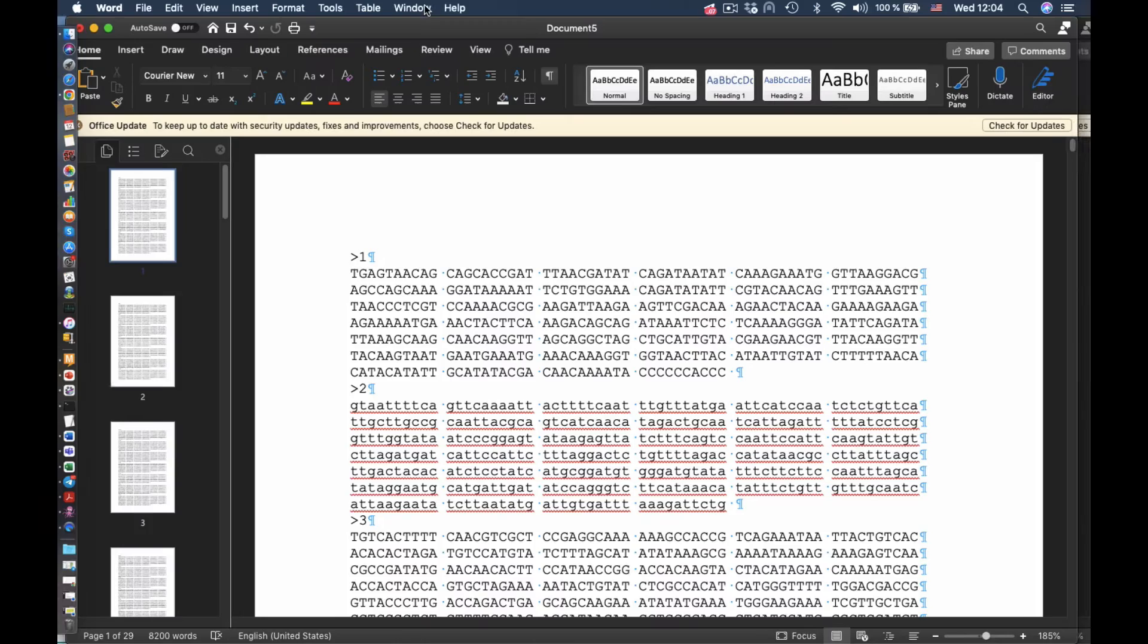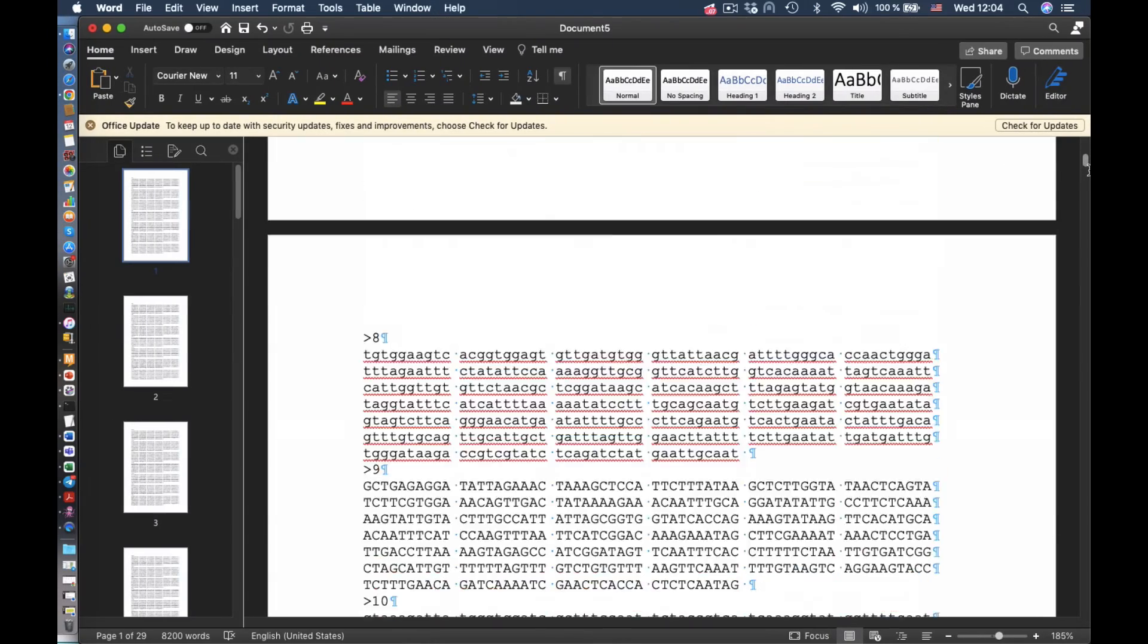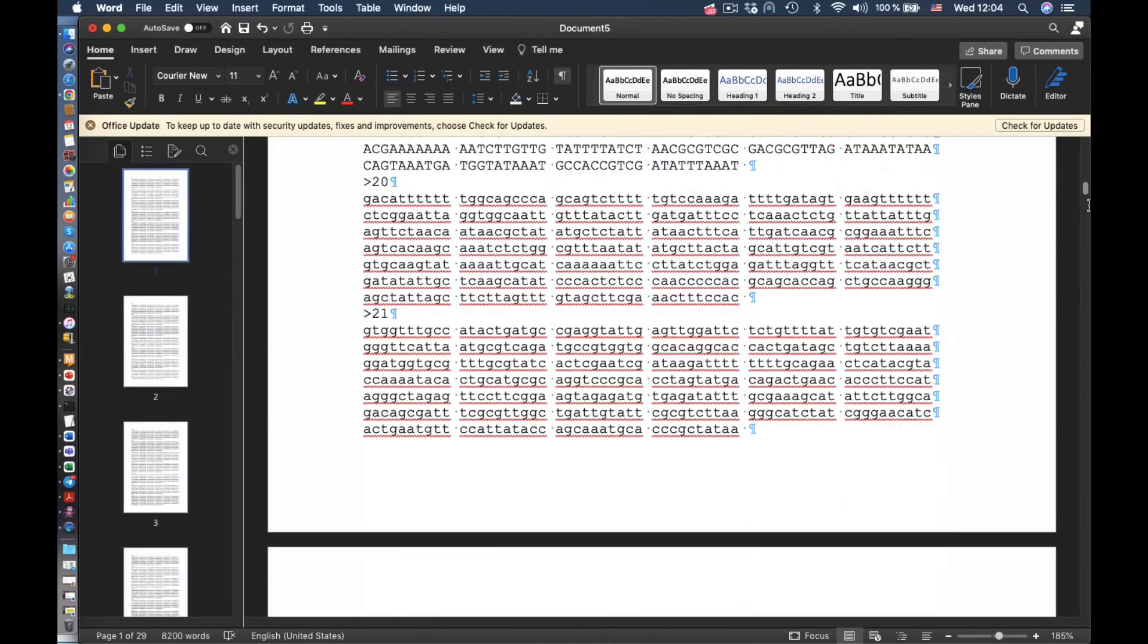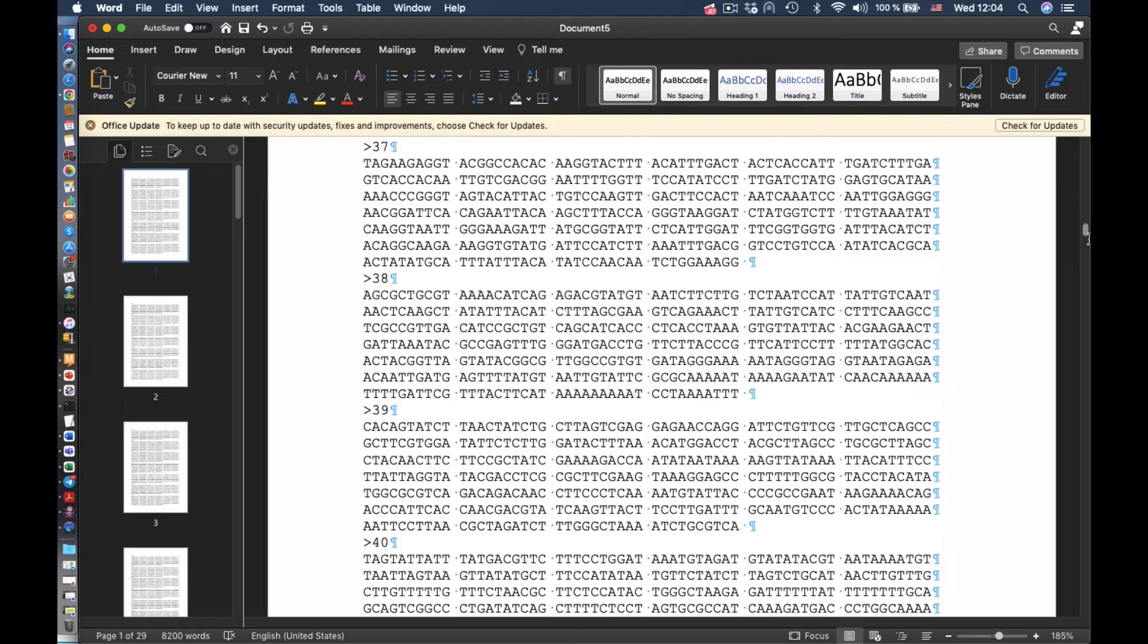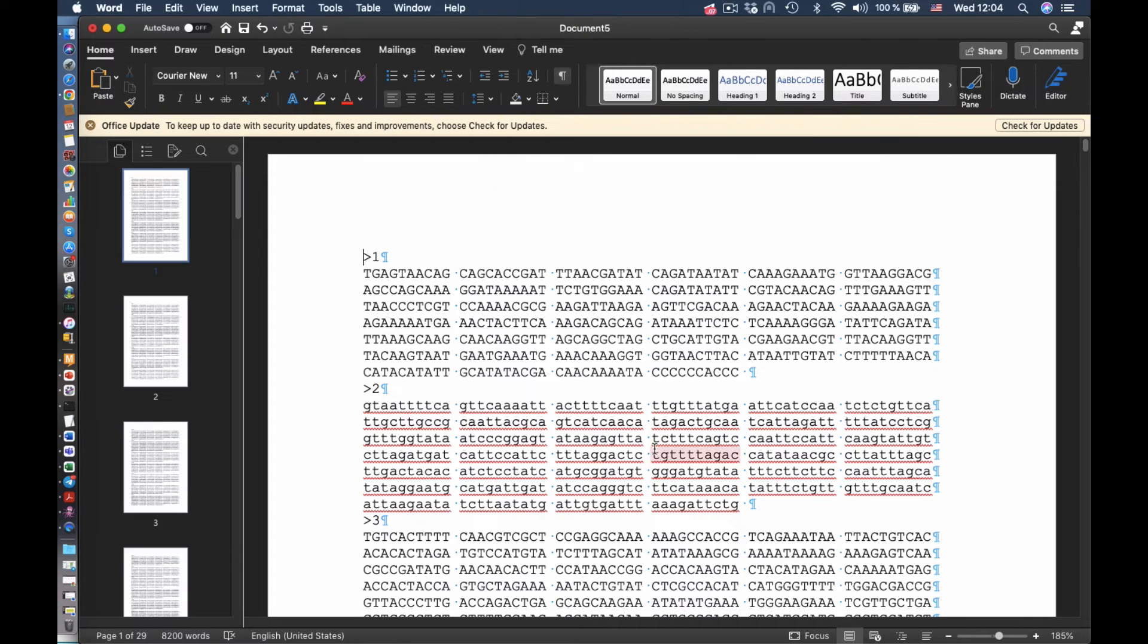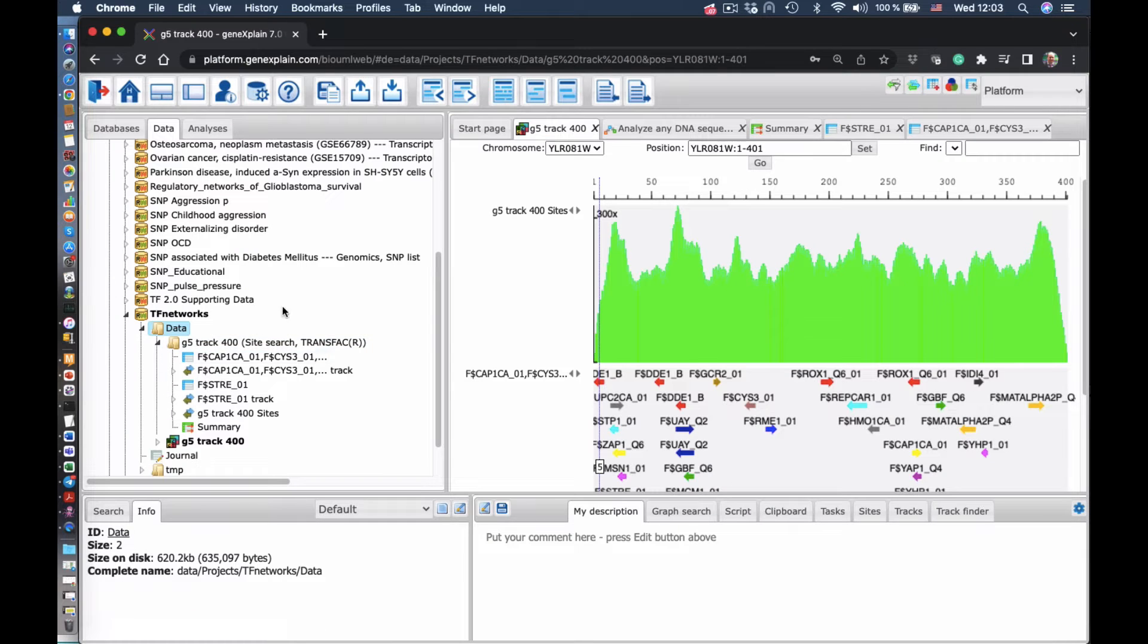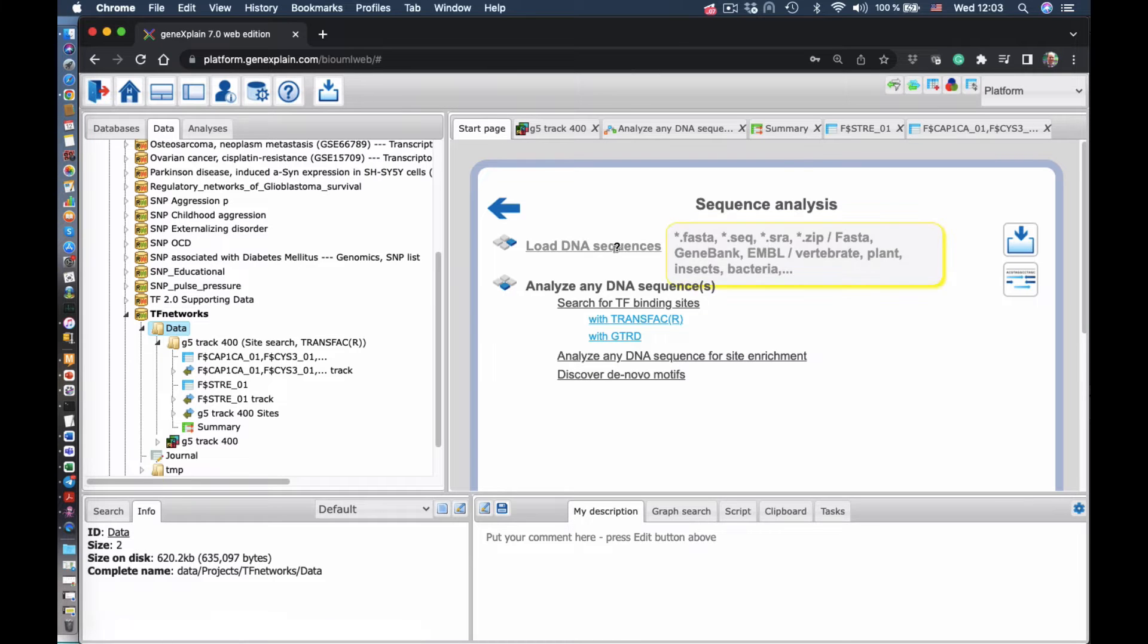Now we search for Transfac site enrichment. For that, we need a background set of sequences. As a background, we choose these random sequences, which can be generated in our platform.